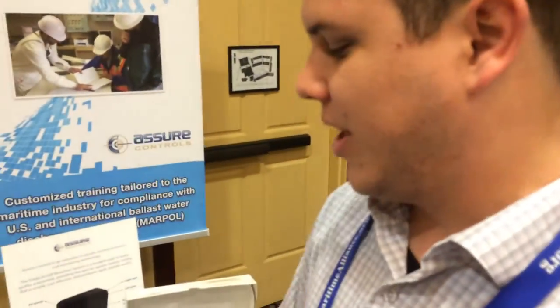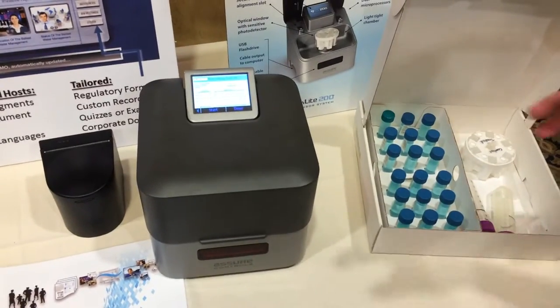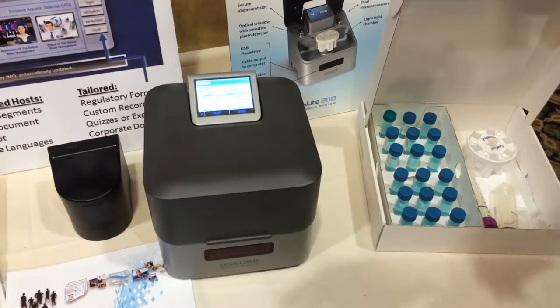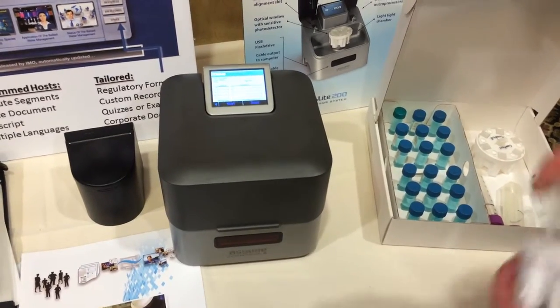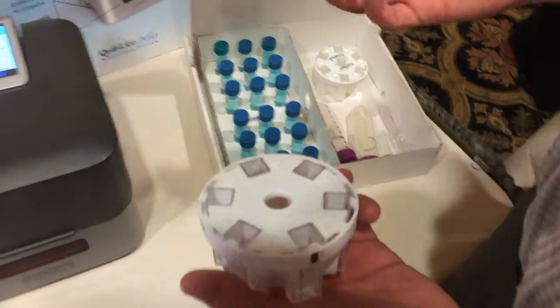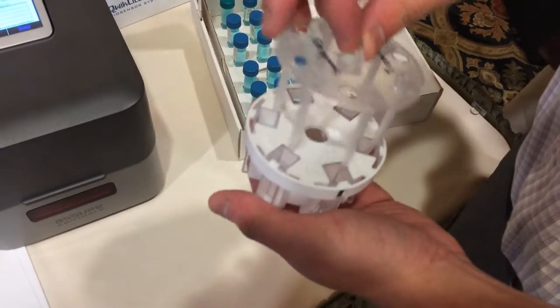Our product's called QuickLight. This is the QuickLight 200 and this is the QuickLight 100 from Assure Controls. We're measuring bioluminescence of our plankton and using it as a biosensor. First we'll take a control reading of just artificial seawater and plankton. That'll be filled up in this cartridge with our control — there are six replicates in there so we can get an average and a better data set.